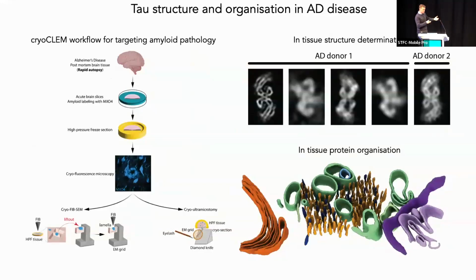And through quantifying polarity orientation and filament spacing, we found a correlation which suggests that there could be some level of interaction between filaments that could be controlling how they're oriented. We're currently looking at data from a second donor, and so far the initial data is recapitulating these results.